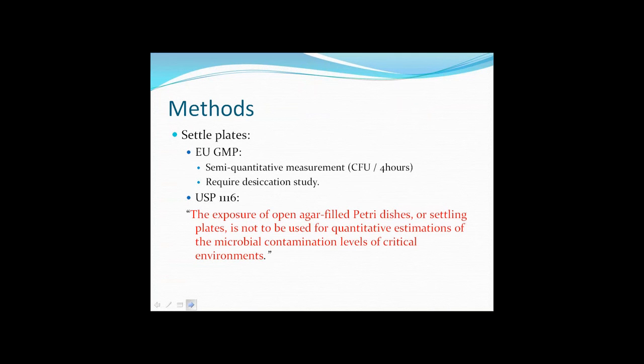Okay, so moving on to the monitoring methods. The USP does touch on settle plates and generally infers that settle plates should be used as indicative only and should not really, due to their limitations, be considered as quantitative measurements, which does draw up another contrast with EU GMP Annex 1.